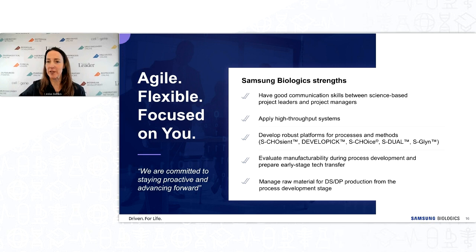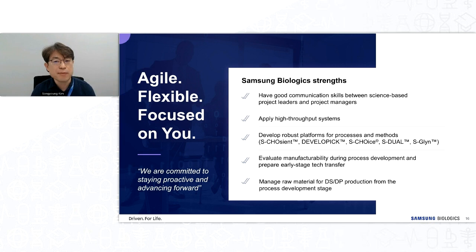For the first question: what are the key parameters and variables considered in silico modeling other than the net charge and chemical bonding? And can in silico modeling assist in the design and optimization of filtration as well? Until now, significant results have been found in net charge and chemical bonding within the model.